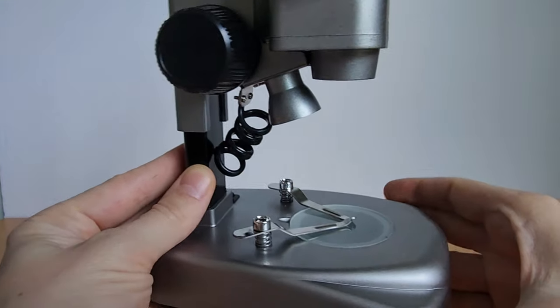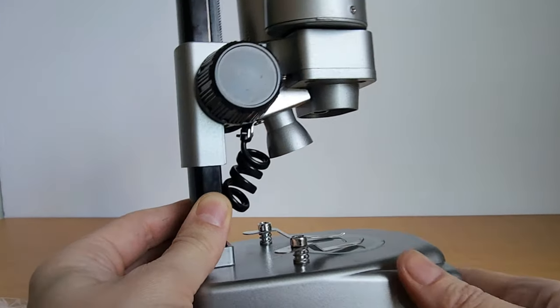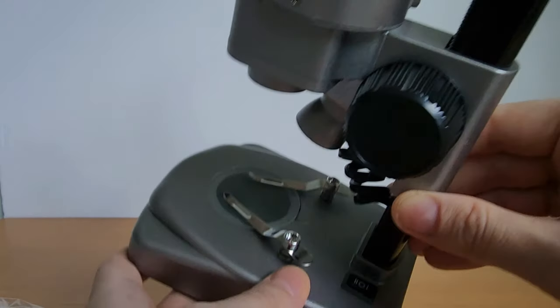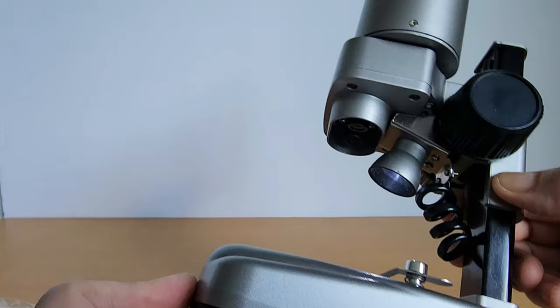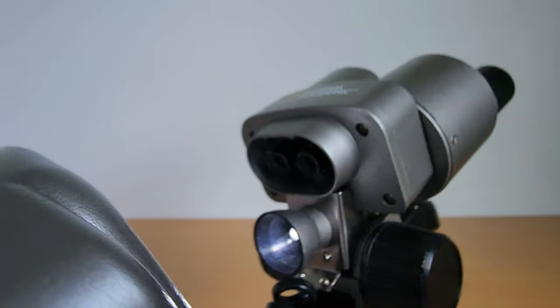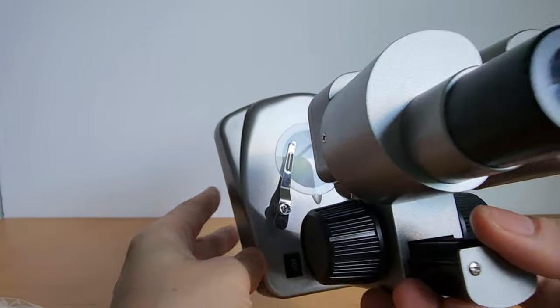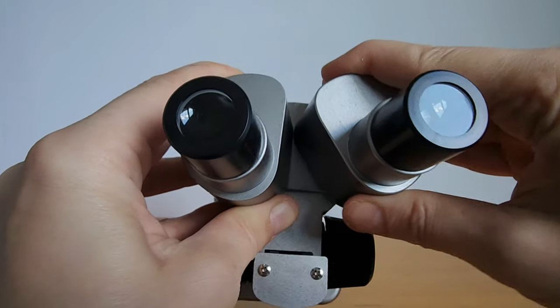This National Geographic Microscope is pretty well made for a starter microscope. You have your place where you can put the prepared slides, and it comes with over 50 different pieces, including 10 already prepared slides and 10 blank slides and little Petri dishes and a brine shrimp experiment. And it has different lenses for you to use.